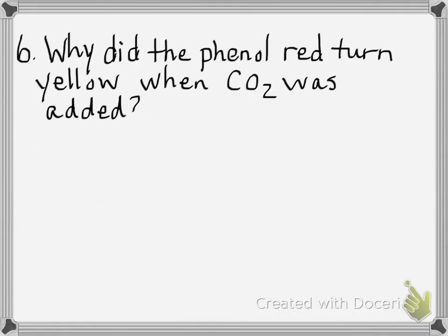Okay. So first we took a beaker, put water in it. We put this pH indicator called phenol red into it. And then, do you remember how we put CO2 into the water? Blew with a straw. And we blew until the phenol red turned yellow. So just check your notes on page 74. If it was yellow, that meant that we were high in CO2.